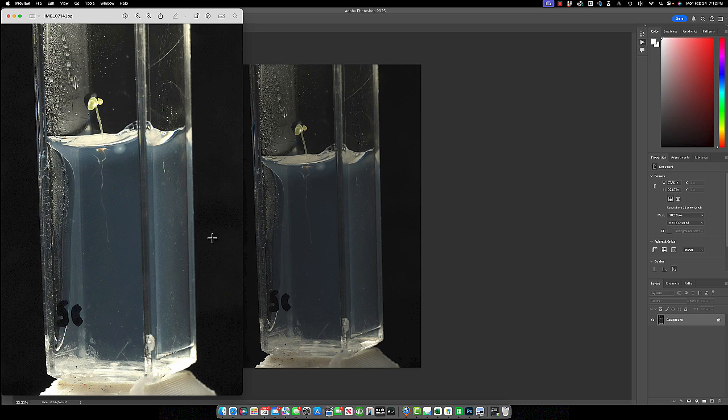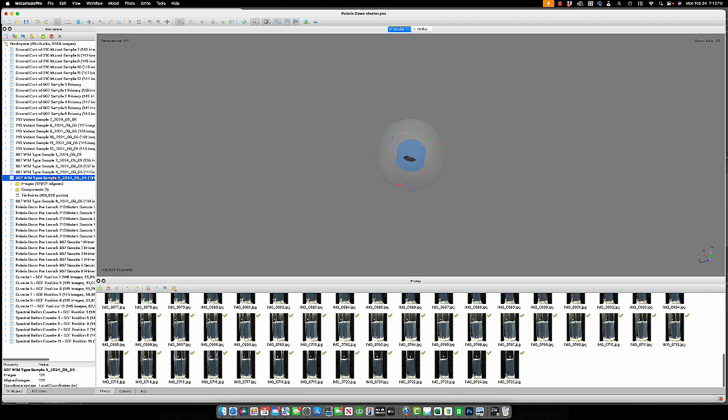What I have done is I've rerun all of the images where I reshaped the contrast, and I did get a result. So this is the result here. It's still not exactly perfect. You can see if I were to just zoom into this, it's a lot of data, so it's going to take a second.